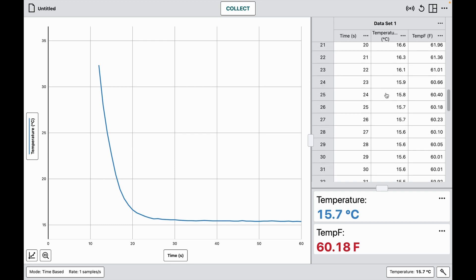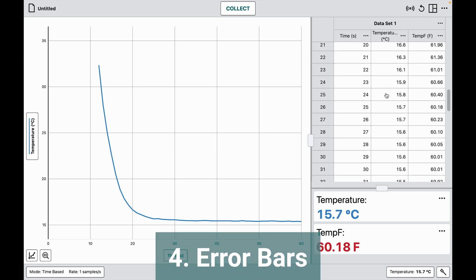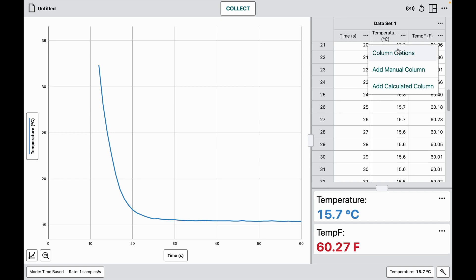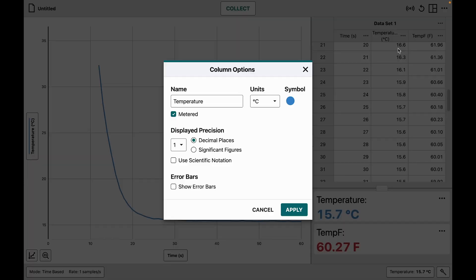Another feature Logger Pro users are familiar with is error bars, which show the variation we can expect in the data as collected by the tools we're using. Error bars are a function of the column itself, so to set the error bar for a particular curve, I choose the column options for that column and I have the choice to show error bars.